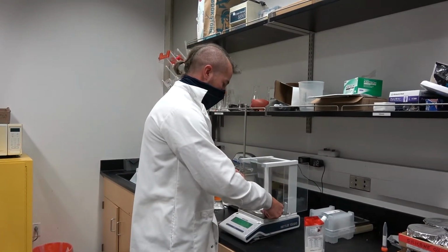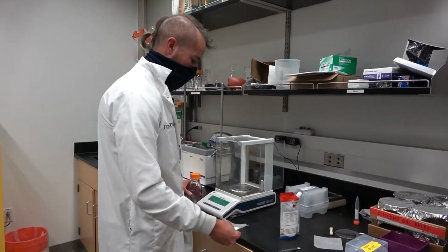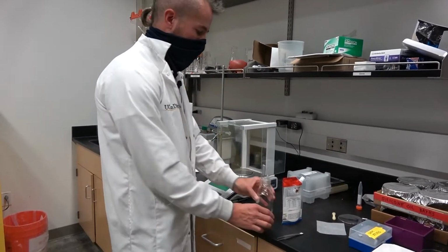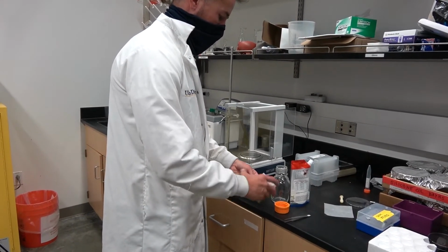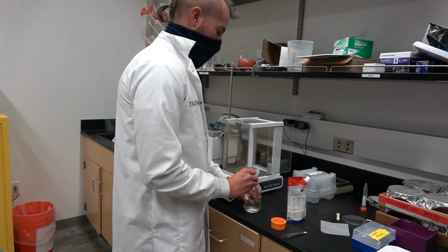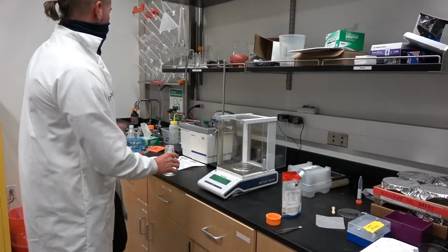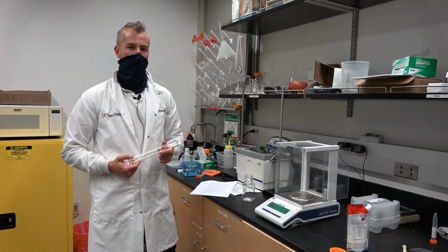So then we can just carefully transfer this. And then I'll just go ahead and add 100 mils of water with a graduated cylinder.